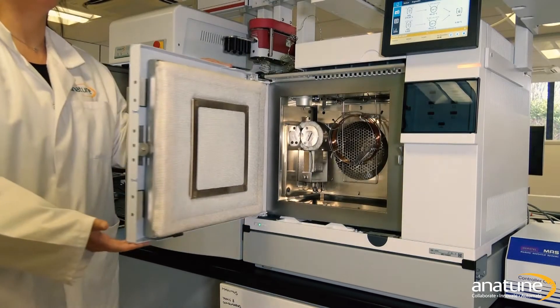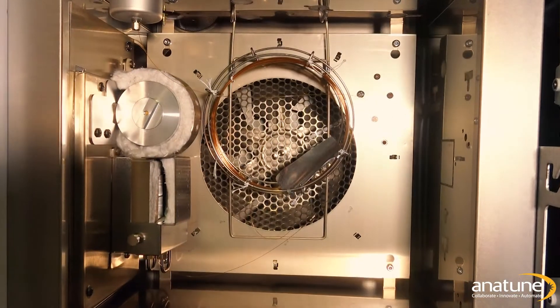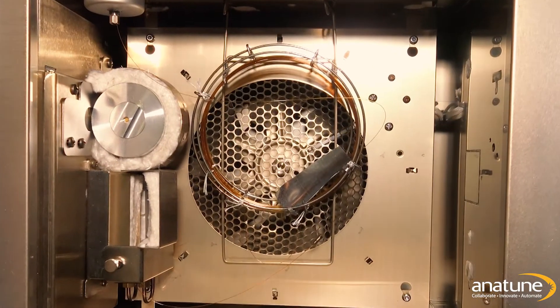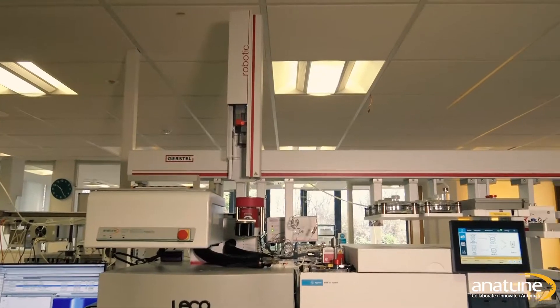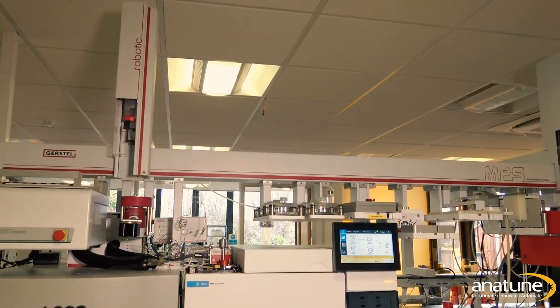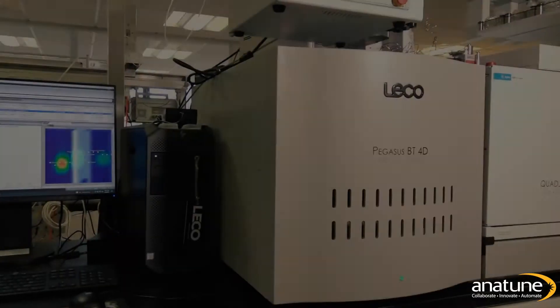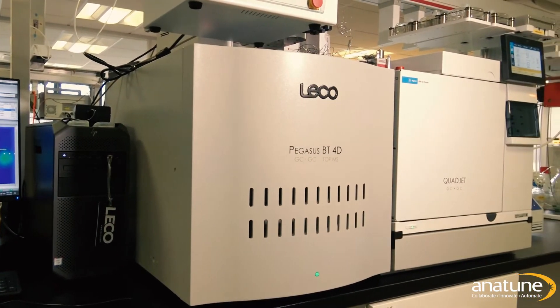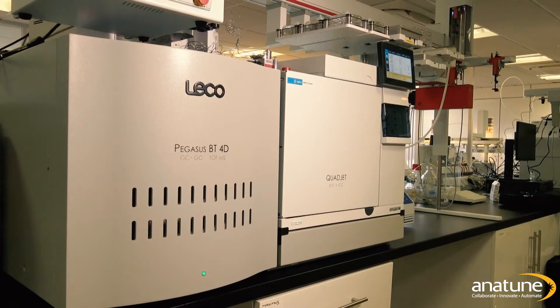Two-dimensional gas chromatography, also known as GC×GC, is often best utilised by analytical R&D departments who are confronted with a wide range of challenging separations on a regular basis. Our team of application chemists have been working on combining the Gerstel Multipurpose Auto-Sampler with the Leco Pegasus GC×GC TOF MS to see how we can augment the gold standard of analysis.